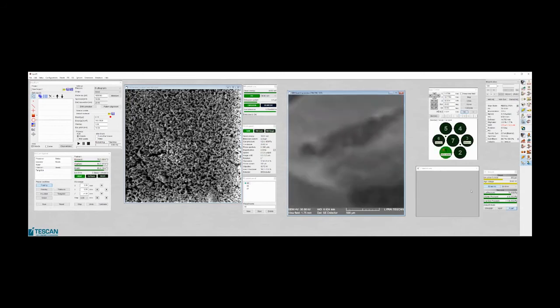You can check that I'm moving with the nanomanipulator. Okay, something is coming. And here in this scanning electron microscope window, you can check that we have a tip. It's not in focus now. I will scan faster. Okay, so here we are. Here we have this tungsten tip.